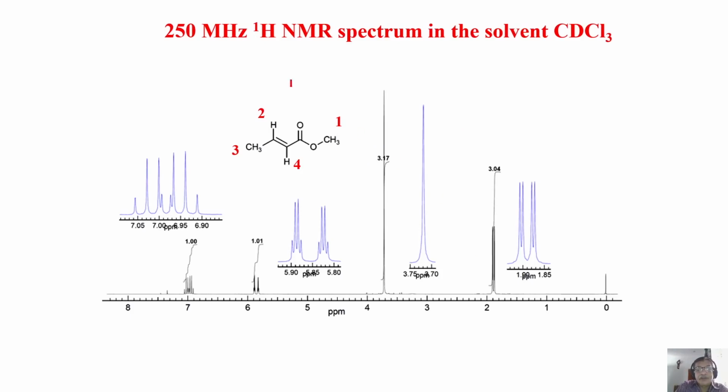Look at this one. This molecule has one group of protons, 2, 3, and 4. Now there are only 4 types. How many peaks are present here? One here, one here, one here, and one here. Analysis is simpler. First, you can analyze very easily one of the peaks.